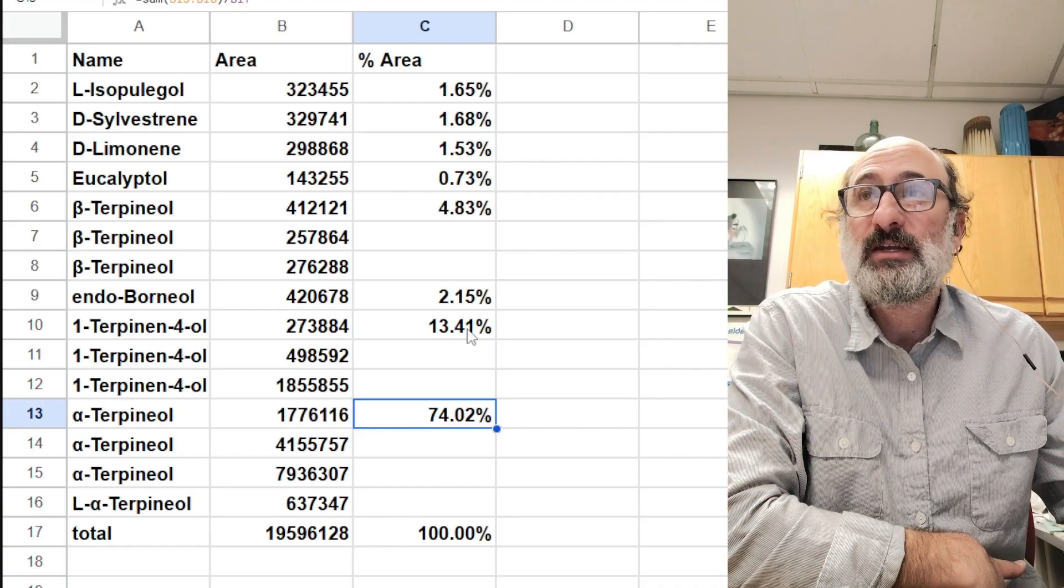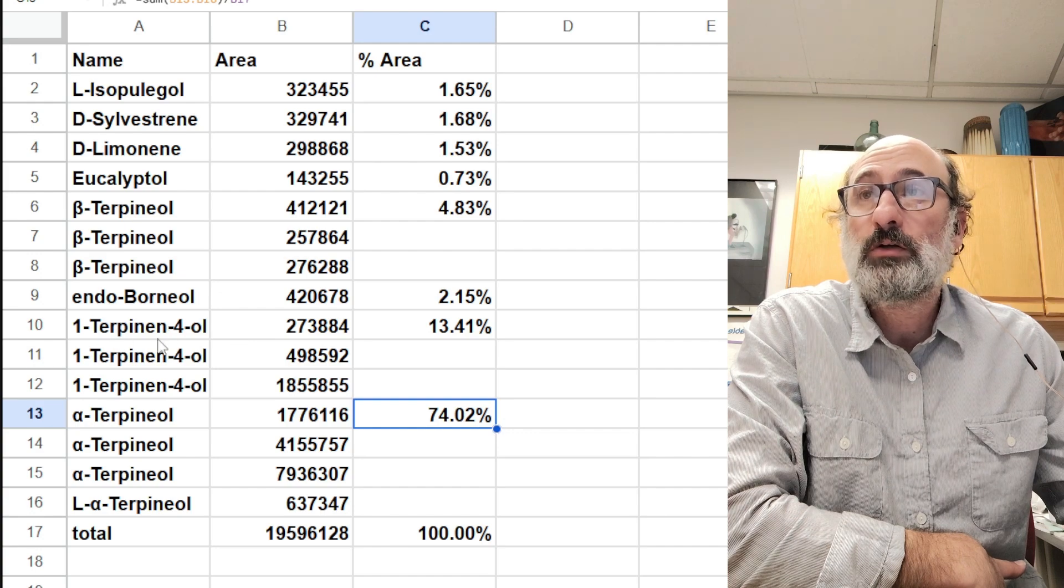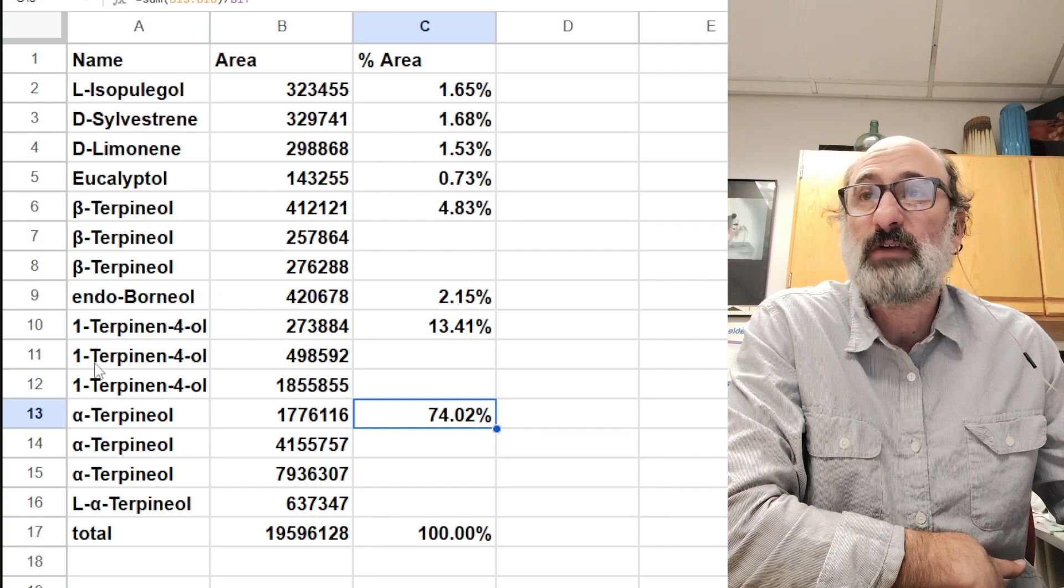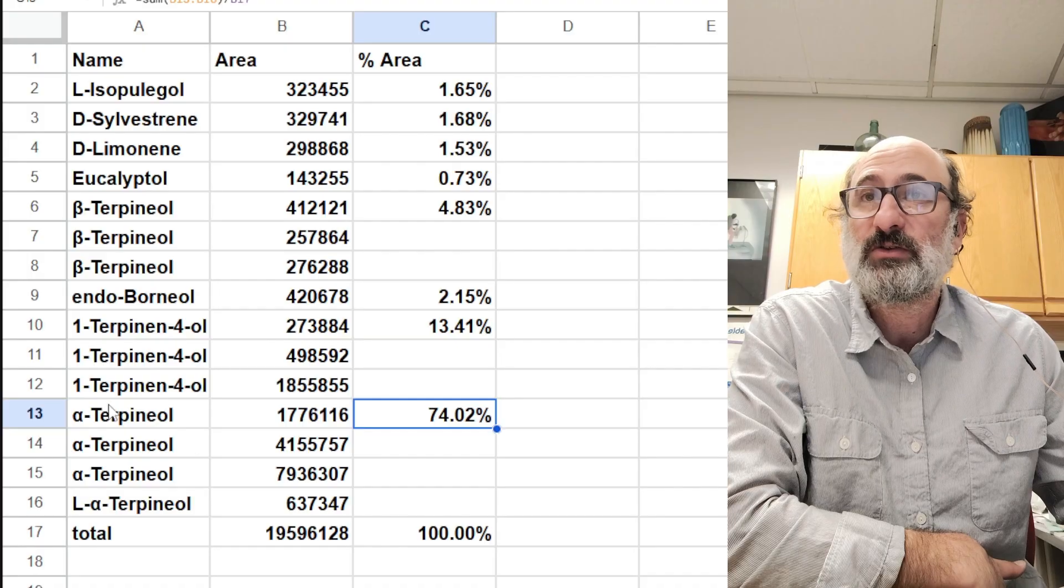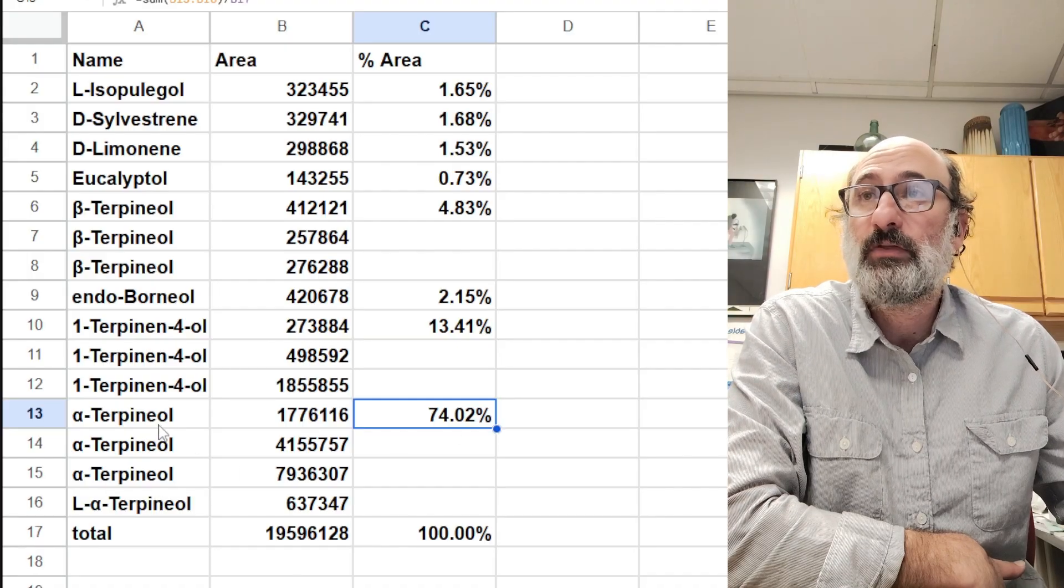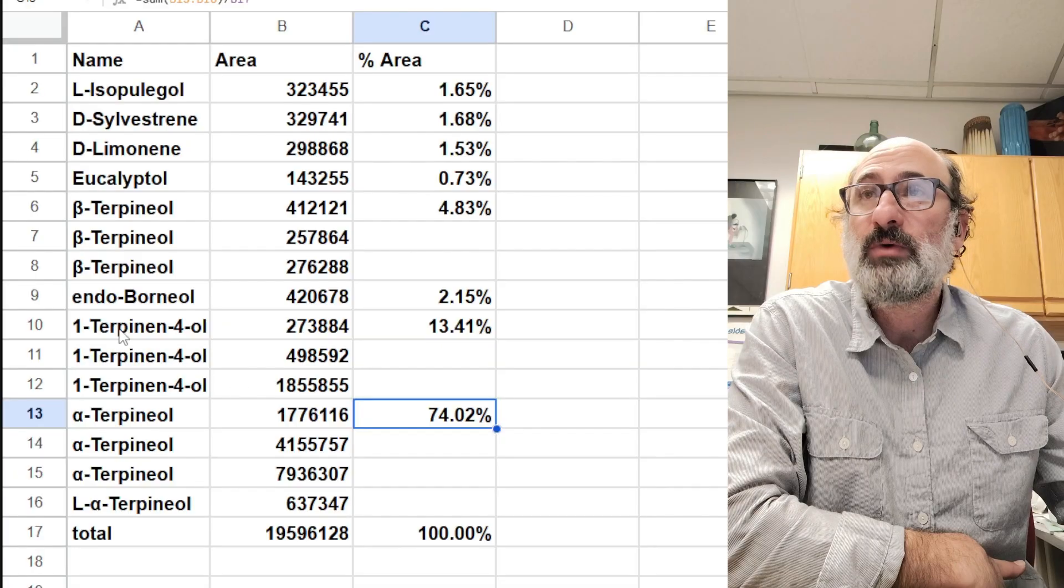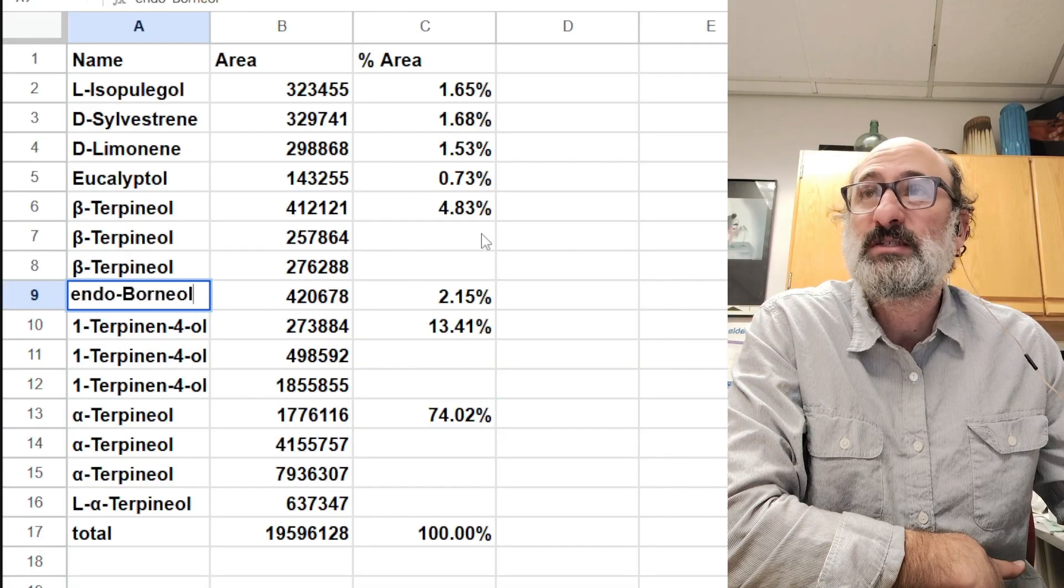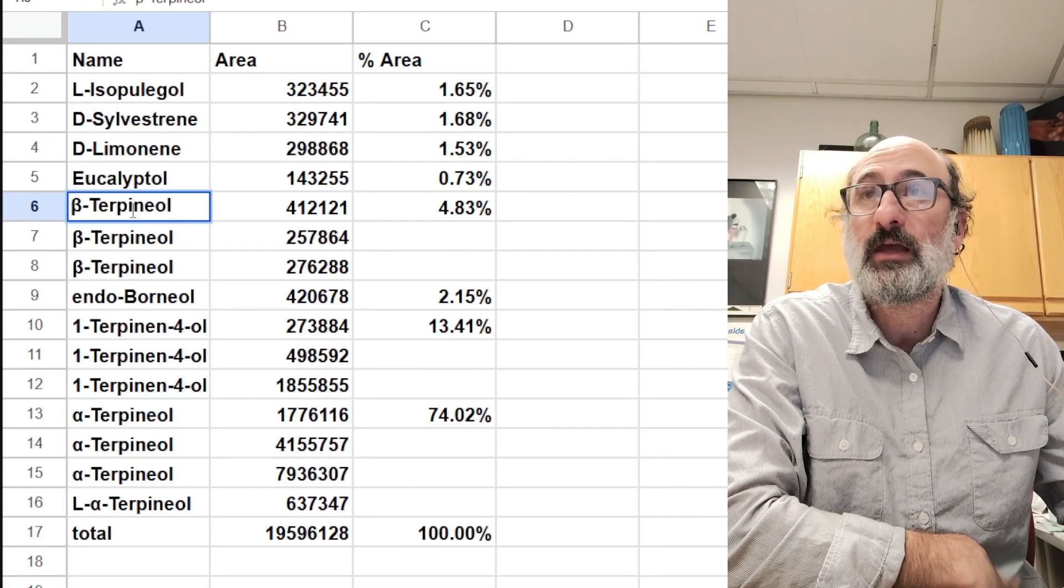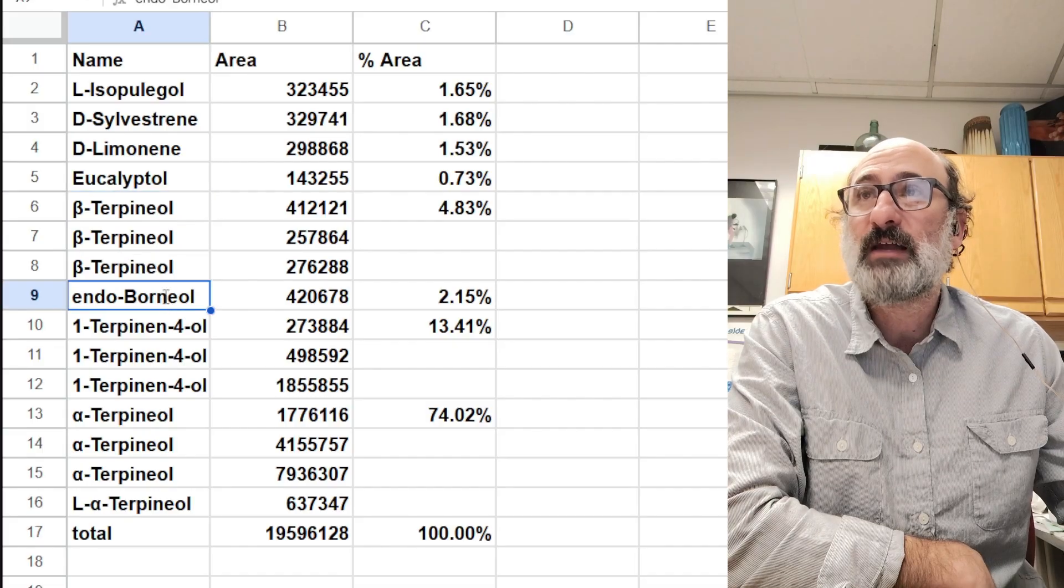Then the rest, 13% is this terpinen-4-ol. These are kind of nondescript flavors with nondescript sourcing, so they're very difficult to just buy these mixtures. And then we have beta-terpineol. Again, same kind of thing.